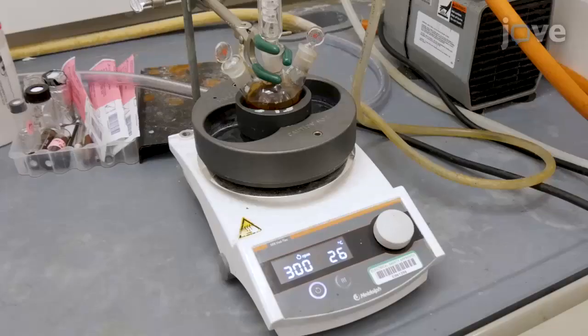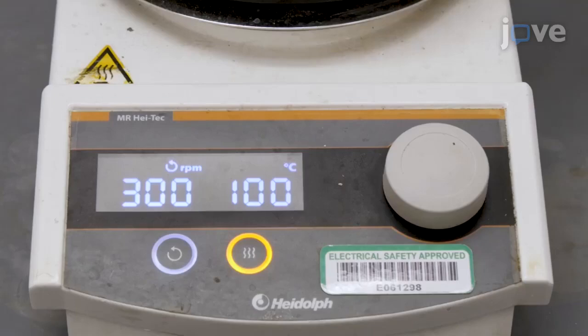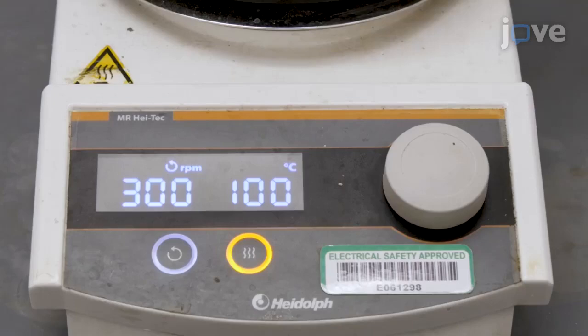Then set the hot plate to 100 degrees Celsius. Continue stirring the mixture at 100 degrees Celsius until the palladium acetate has dissolved completely, which usually takes about 30 minutes.